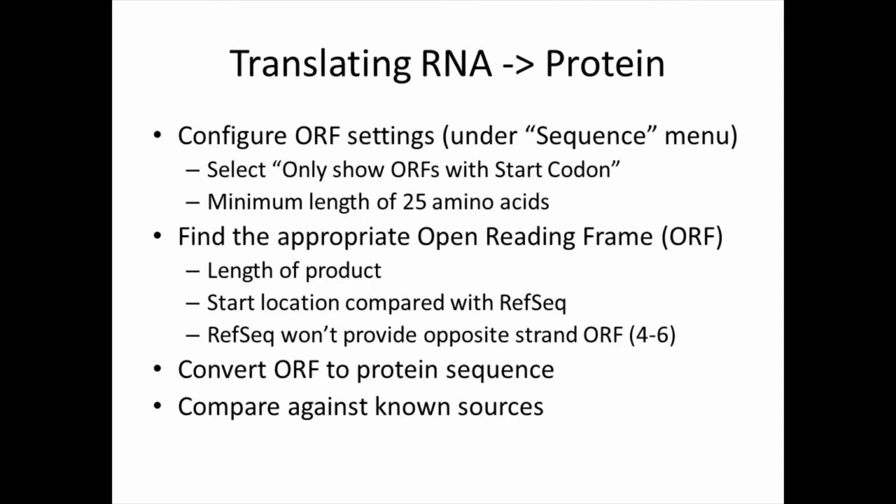Once you do that, then you'll open the application and find the appropriate ORF or open reading frame. There are a few clues that you'll use: the length of the product, the start location compared to RefSeq. Another clue is that RefSeq will not use the opposite strand reading frames numbered 4 through 6 in SeqBuilder. Then you'll convert the ORF to a protein sequence and again compare it to known sequences to verify your work.